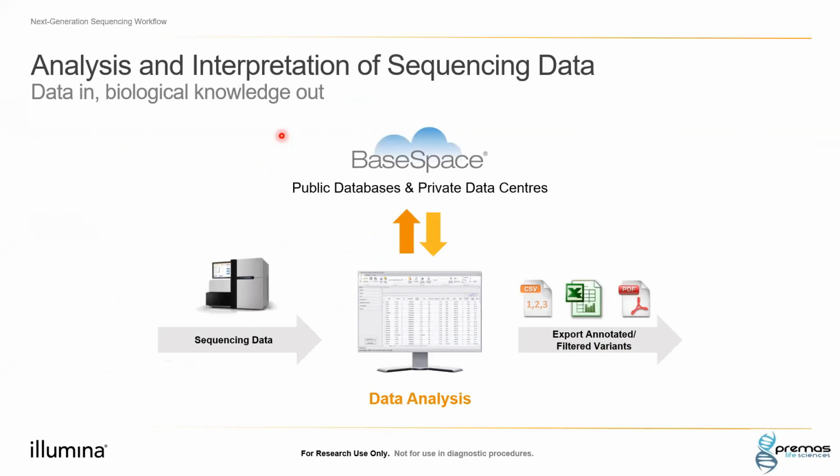Then when you have your individual demultiplexed data, you can go for your further analysis using data analysis software, or you can utilize BaseSpace. BaseSpace is an analysis software from Illumina, and then you can have your variants. It could be anything, for your VCF file, so that can be done from this.